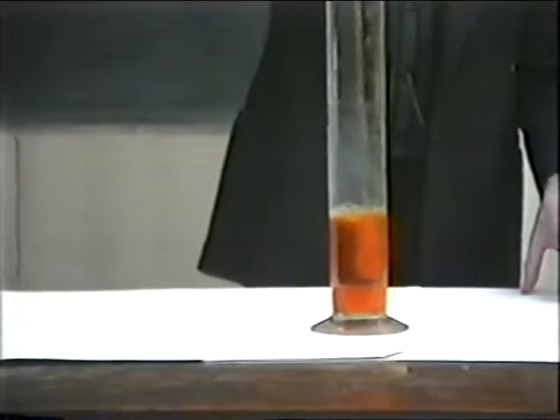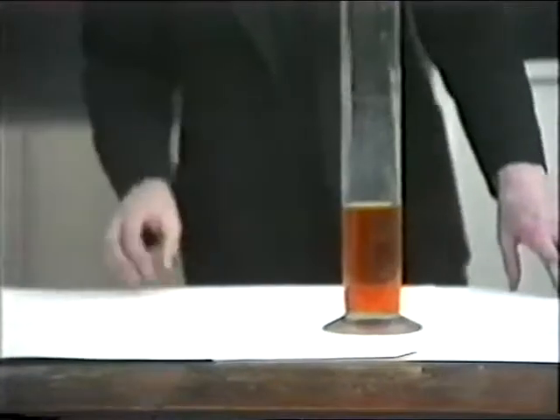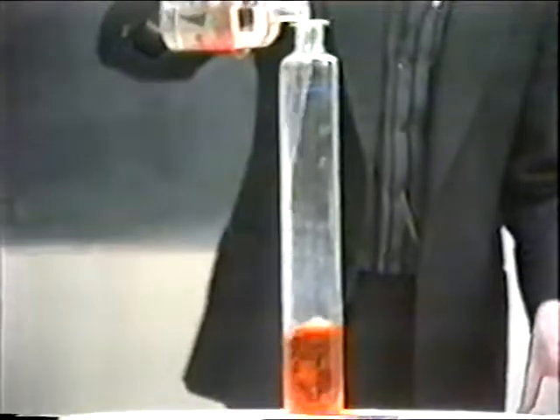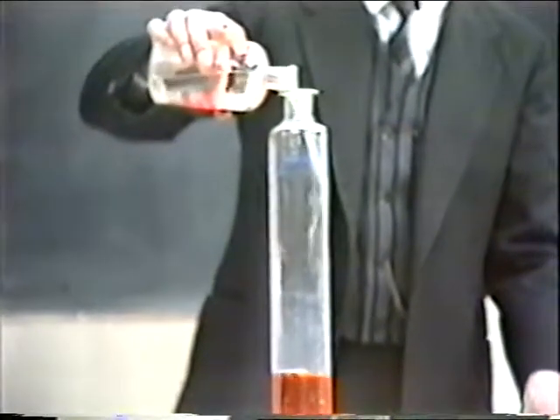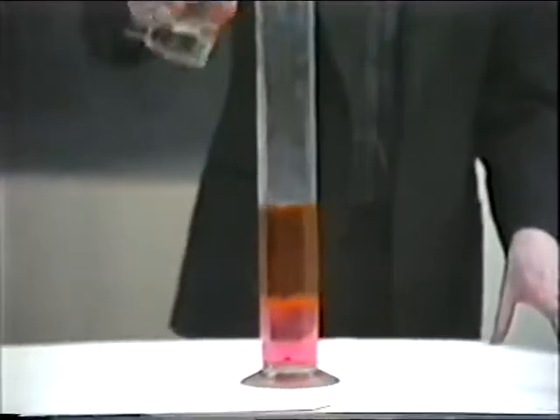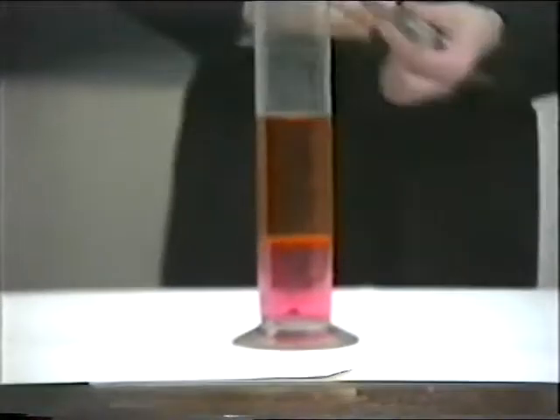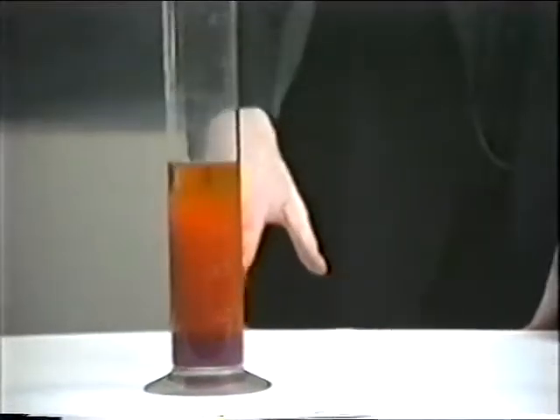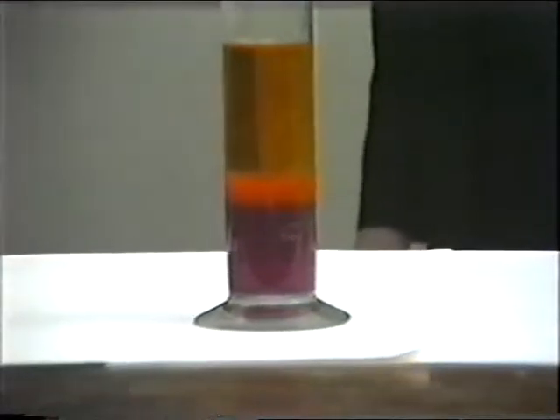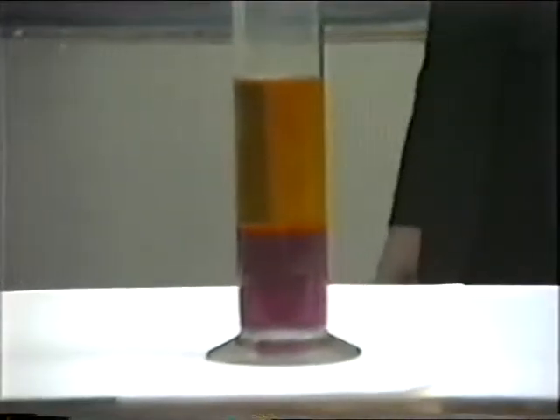We shall pour this dilute iodine solution into the measuring cylinder, and we shall now pour onto it some trichloromethane. And as you observe the trichloromethane falling through the solution, you will observe that a layer forms on the bottom of the measuring cylinder which has a different colour. I will stir up the solution a few times just to show exactly how the colour is formed. And you will notice that there is separating out on the bottom a dense purple layer, or a dark pink layer as it appears to be, of iodine dissolved in trichloromethane.